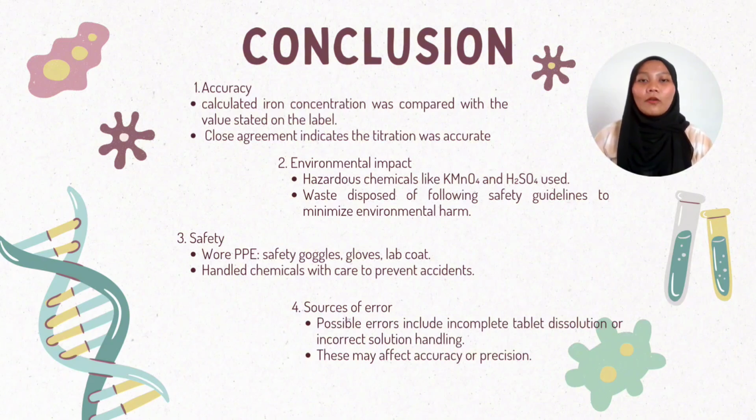Lastly is sources of error. Some things that could cause mistake are not fully dissolving the tablet or not handling the solution properly. So this could make our result less accurate.